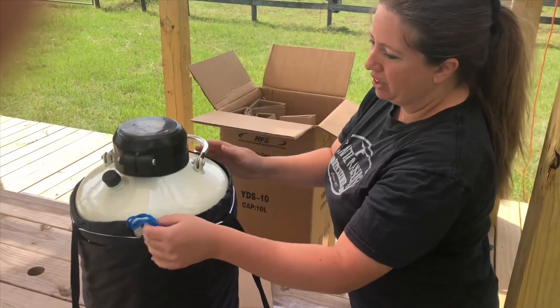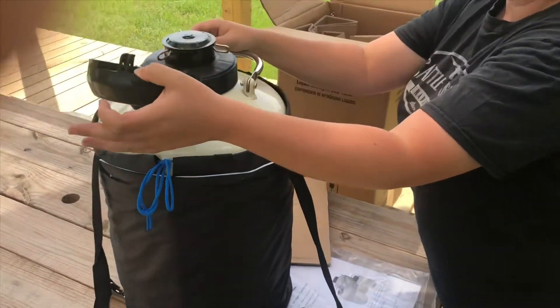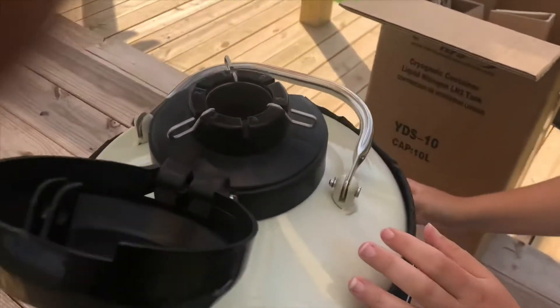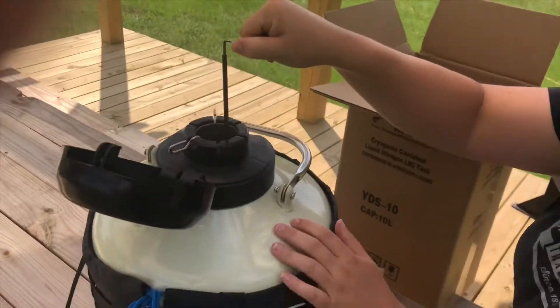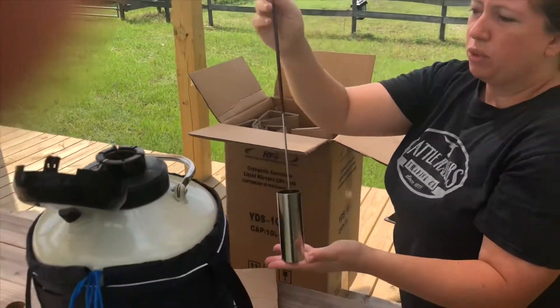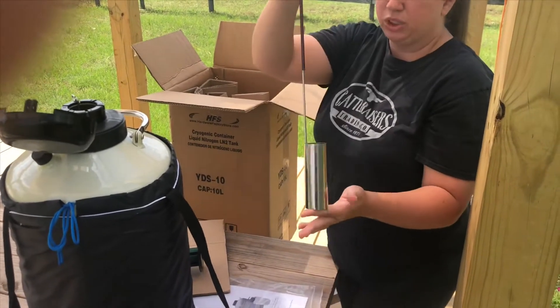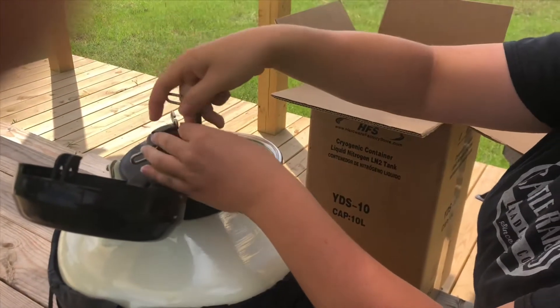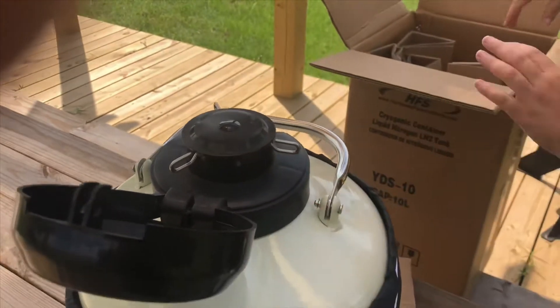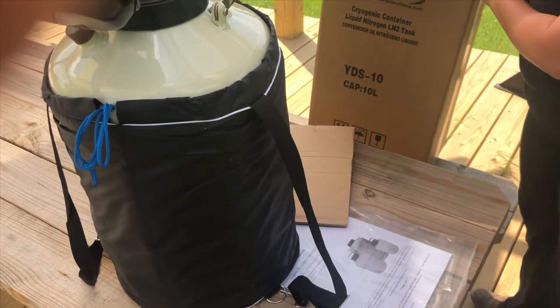You have a carrying case, which will be great whenever it's actually full. Liquid nitrogen is a pretty heavy liquid itself — I haven't gotten to play with it yet, so this is the first time. You see it opens here; you have this where your liquid nitrogen would go in. These are what you can use to hold your straws — a vial of semen is called a straw. This is what you would use to hold that and put it inside for storage.